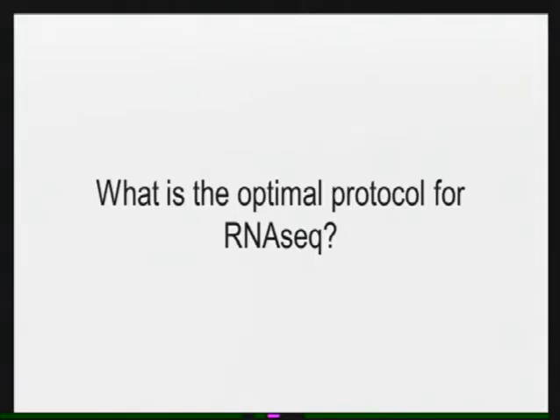Can you say something about what the initial QC you want to do when you first get sequencing data back would be? Like, what would you want to look at specifically? Q30 scores or duplication rates, or what would your checklist be?